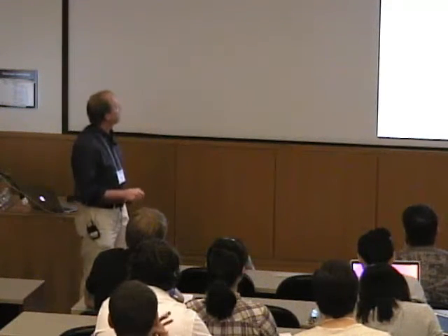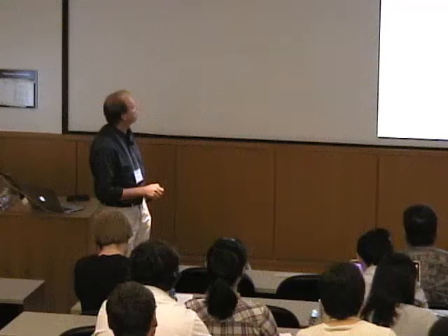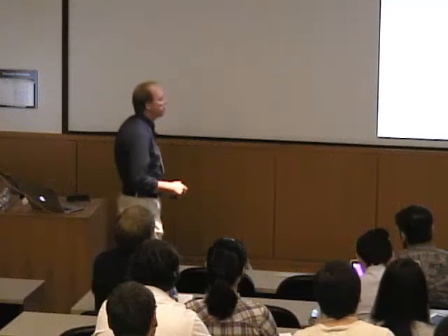Okay, so this is our plan of attack here. I'm going to start by talking a little bit about how the experiment is actually performed, because unlike many other forms of spectroscopy, there are quite a few differences in the way we have to detect the signal and the way it's presented when you look at a spectrum. So I'm going to touch on some of these experimental aspects to show why EPR spectra look the way they do.